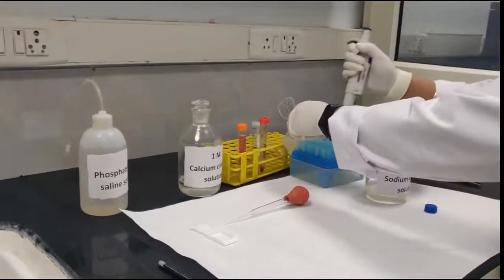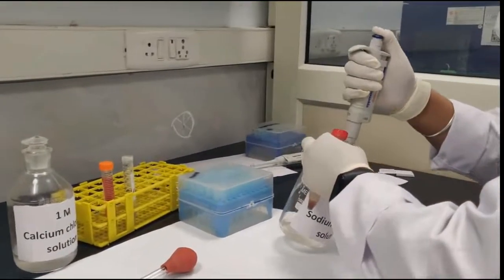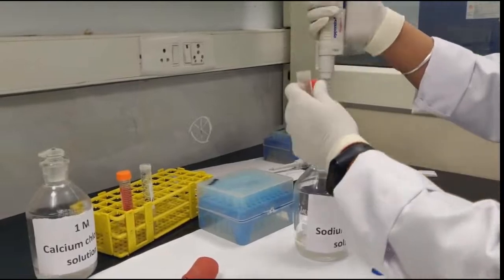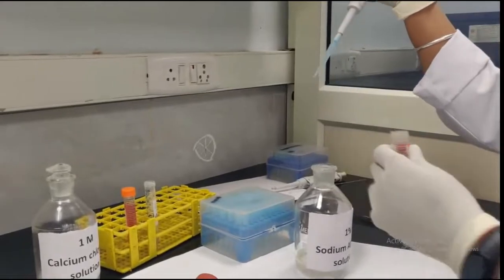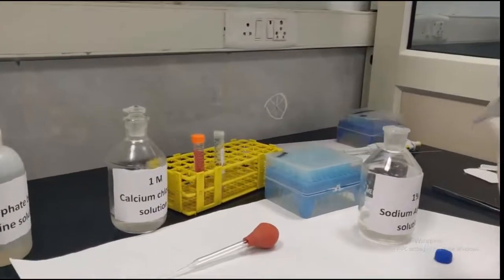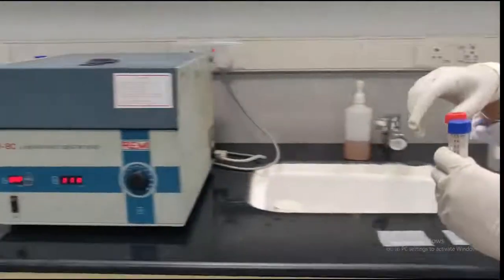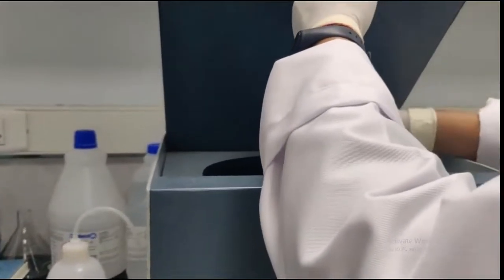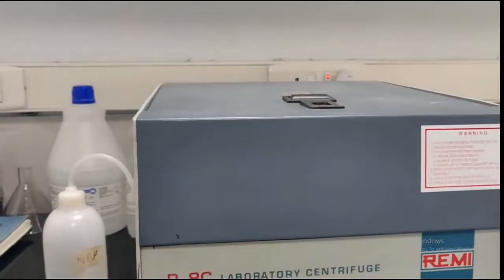So the same solution will be added to the next sample. So 500 microliters or 10 drops of 1% sodium alginate solution. So next step is we will mix it and we will give a spin and centrifuge these tubes at 3000 revolutions per minute for 5 minutes. So this is to ensure proper mixing of the sodium alginate with the pellet.